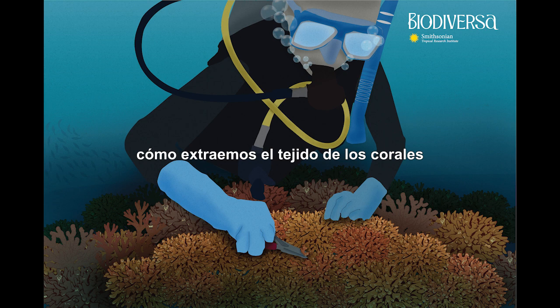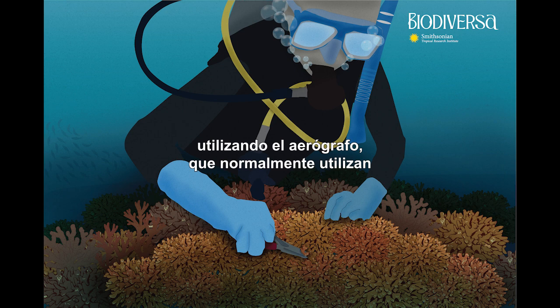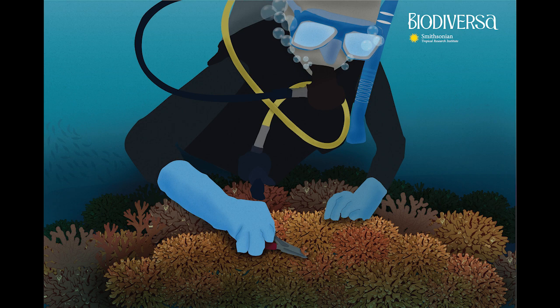Today we are going to show you how we actually extract the tissue from corals using the airbrush that is usually used by painters to spray paint. We adapted the whole system to detach the tissue from corals from their skeleton.